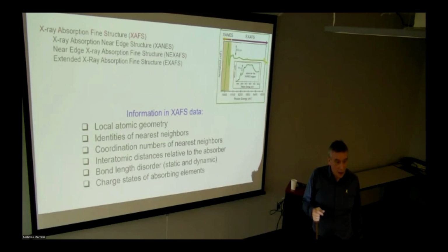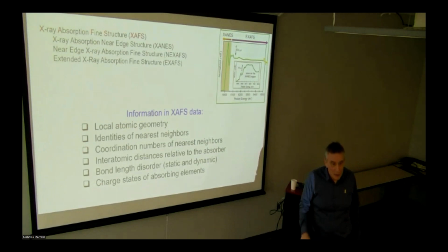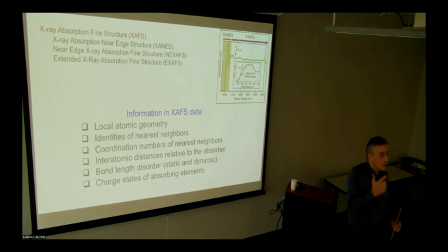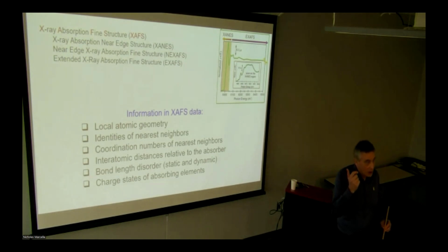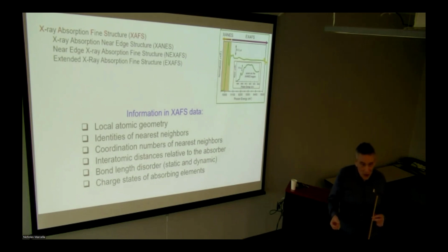Well, if the neighbor is gold, in order to see it, something in the signal should change. Otherwise, we will not tell the difference. So what in the signal will change? We already discussed two things about the signal. The distance contributes to the phase. The number of neighbors contributes to the intensity. What information about the type of neighbor is encoded in this technique?